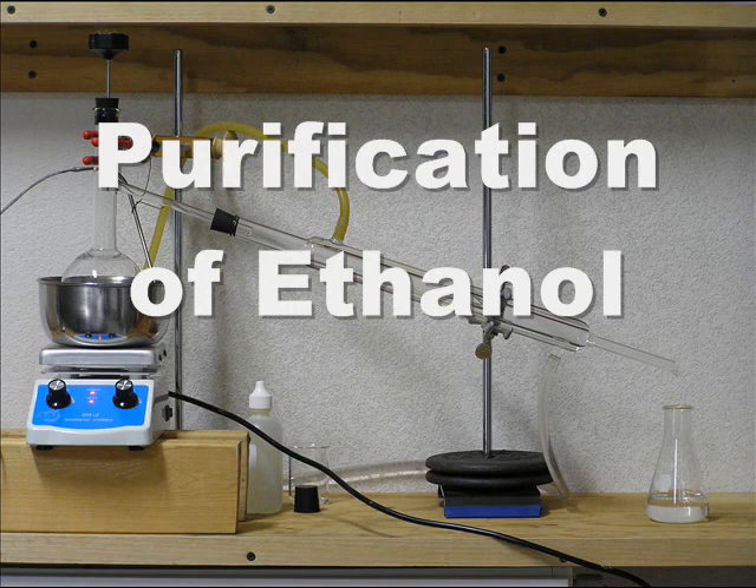Welcome to Paradox Home Chemistry. In this video, I'll be showing how to purify ethanol from ethyl rubbing alcohol through distillation.